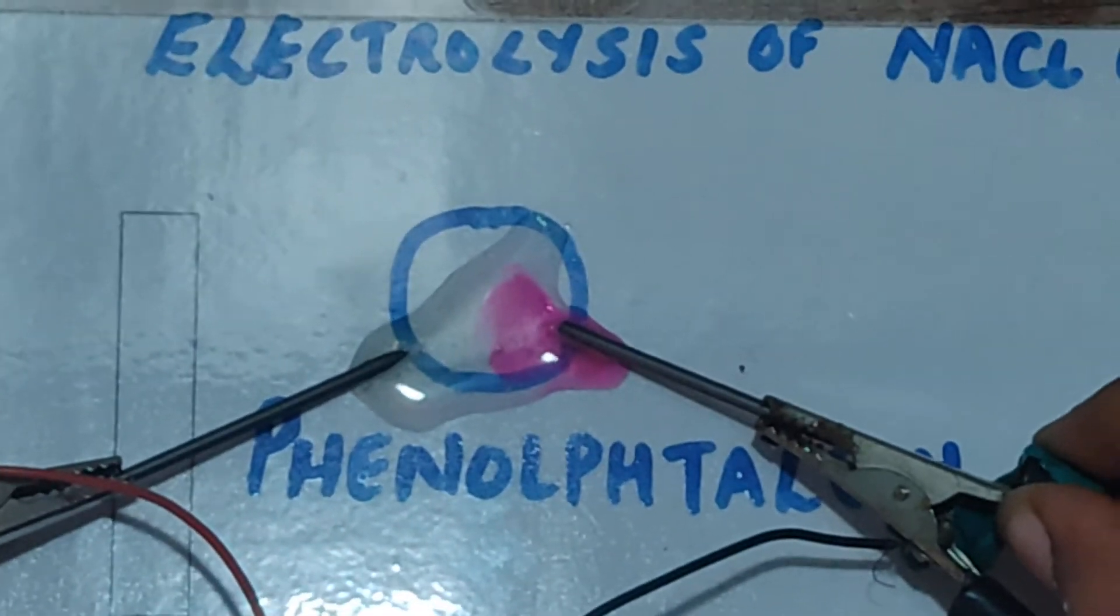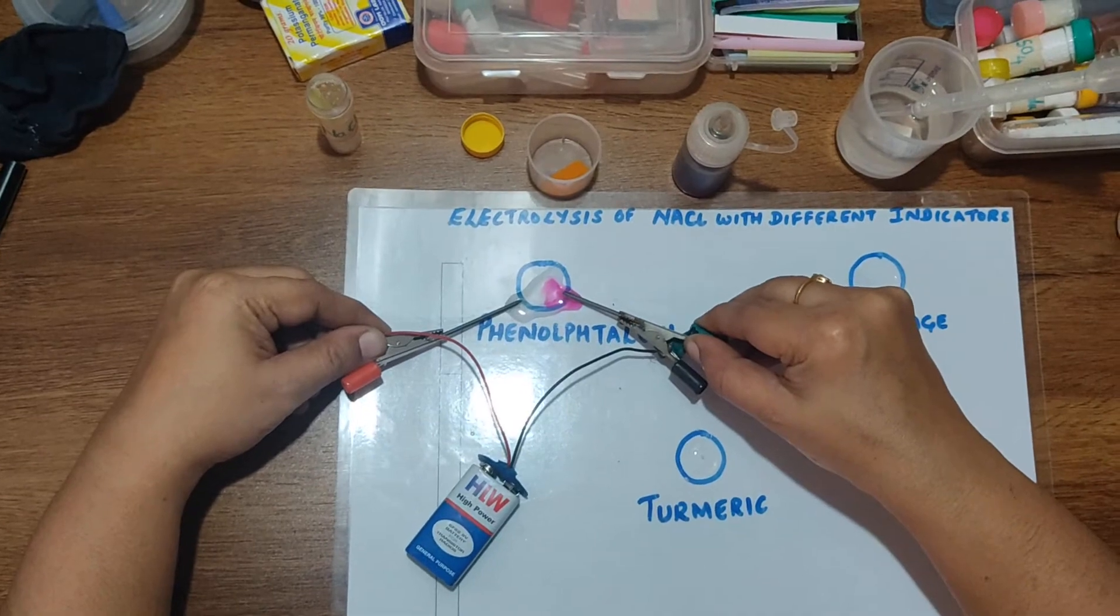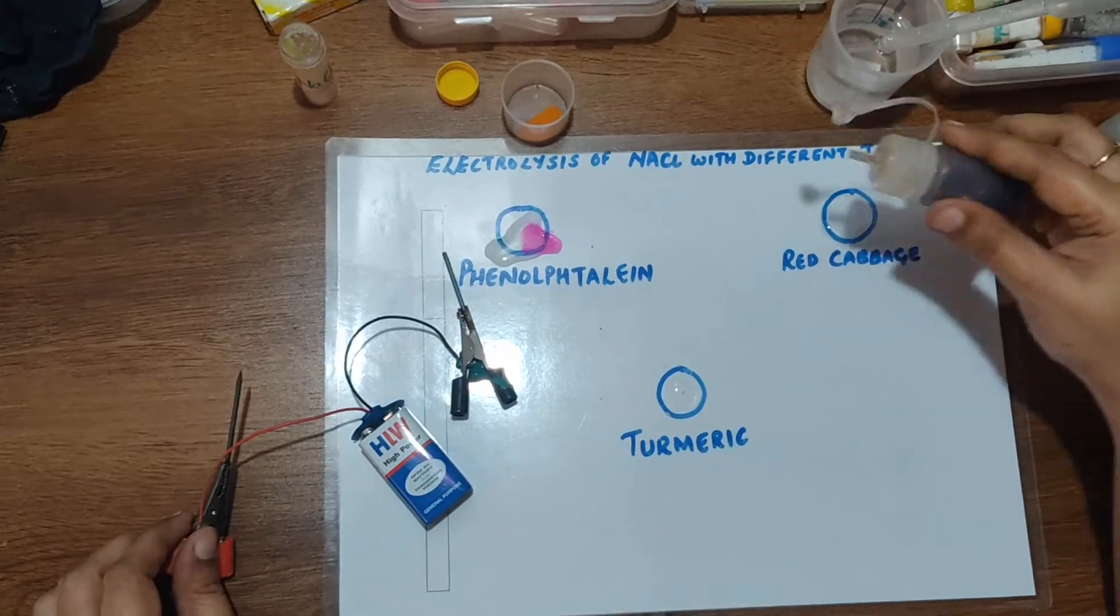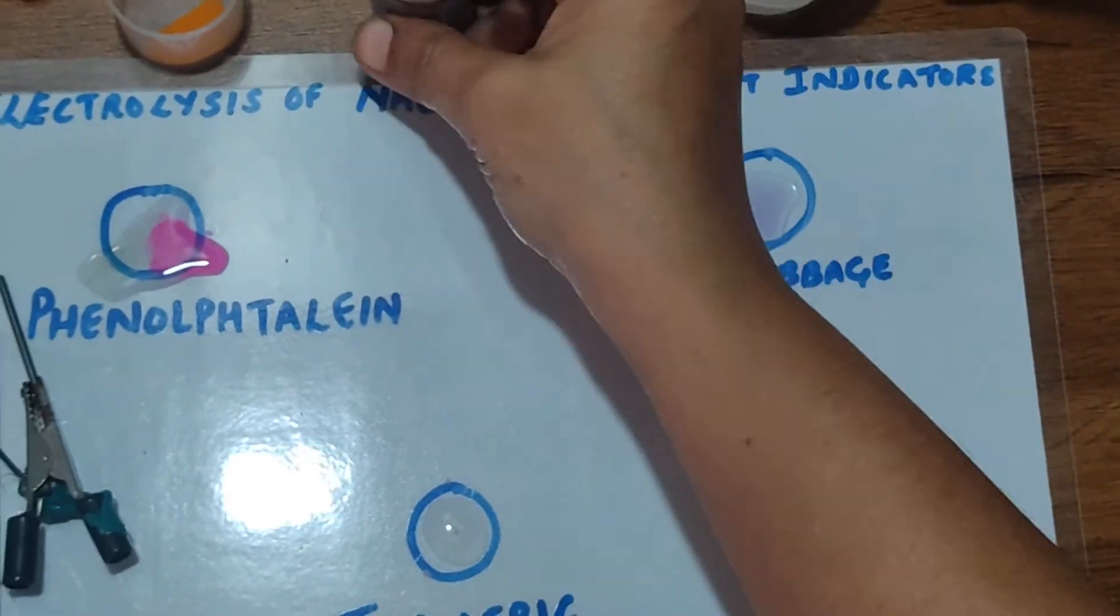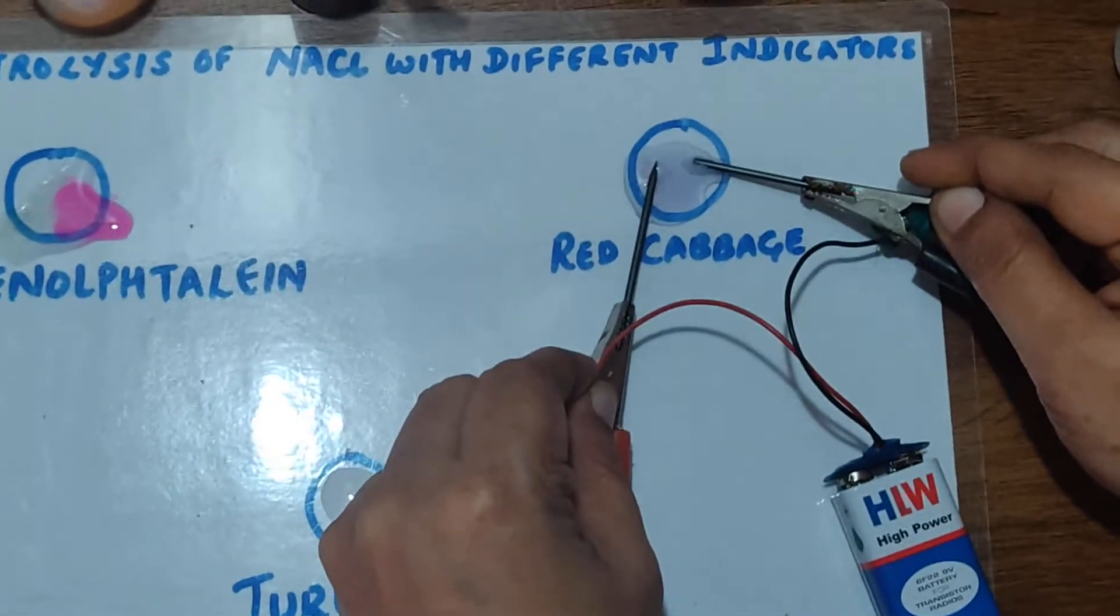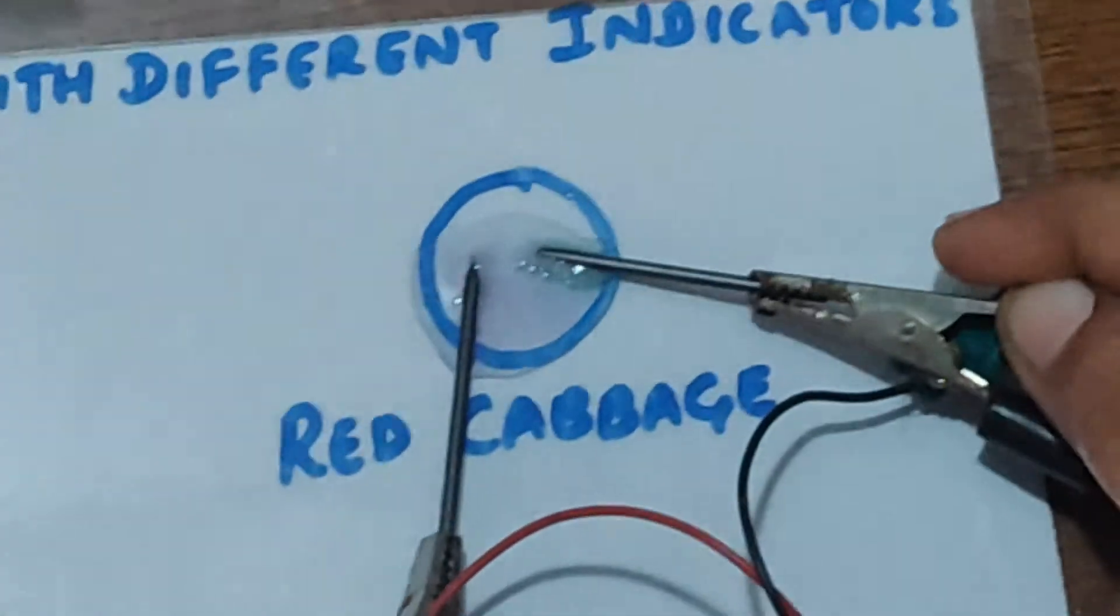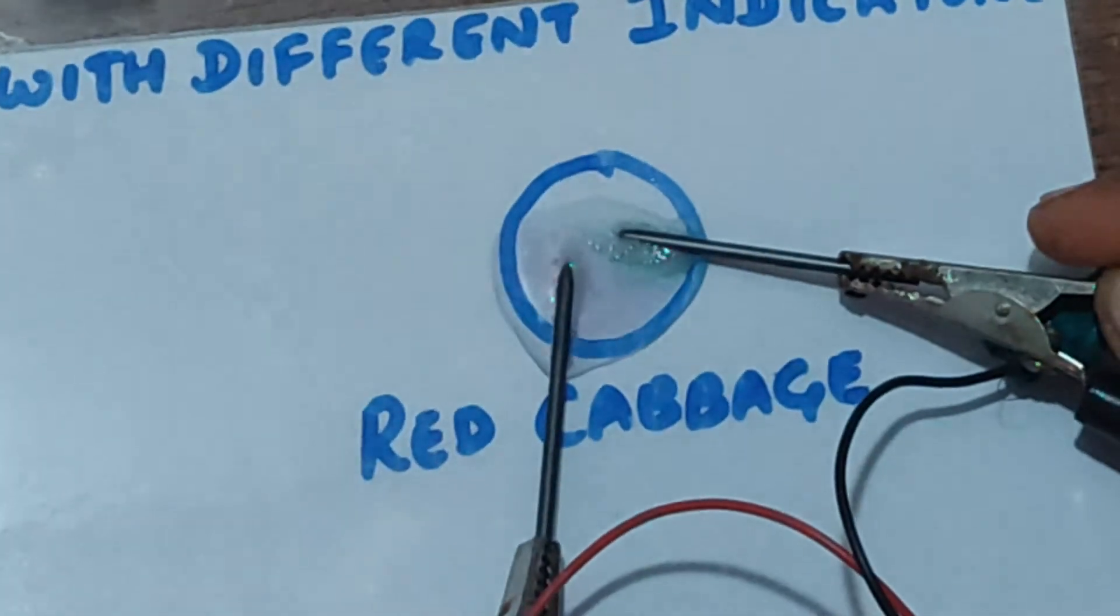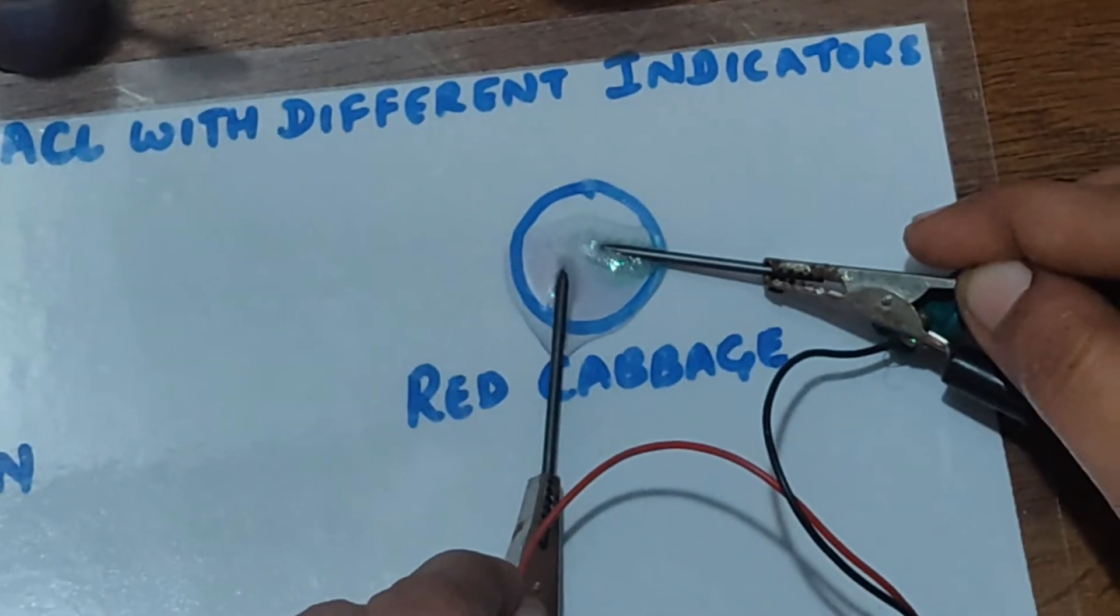Now let us see the reaction that takes place when I add red cabbage indicator. Let me add a drop of red cabbage indicator. You can see at the negative electrode a bluish green color and slightly pink at the positive electrode. And the bubbles are clearly visible here.